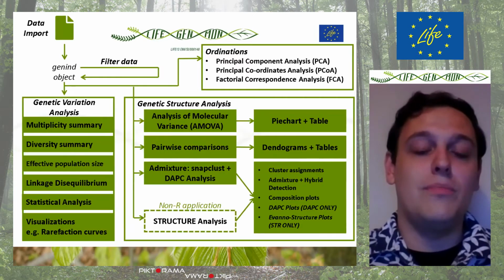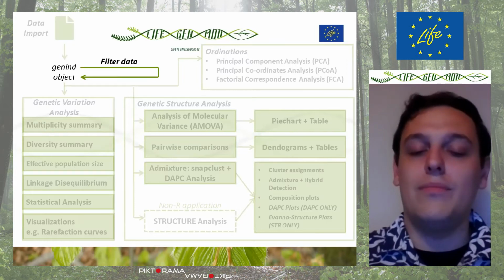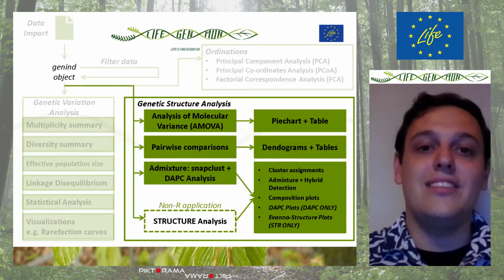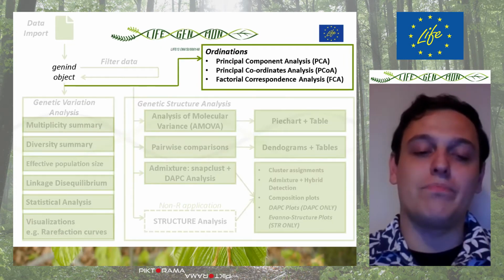So this application can be split into 5 discrete sections. These are data import, data filtering, the analysis of genetic variation, the analysis of genetic structure, and ordinations and visualization of the data.